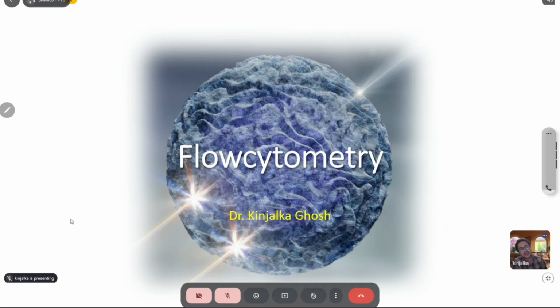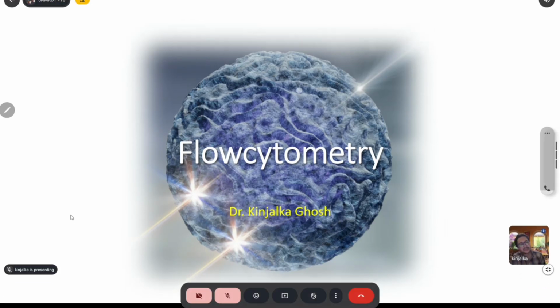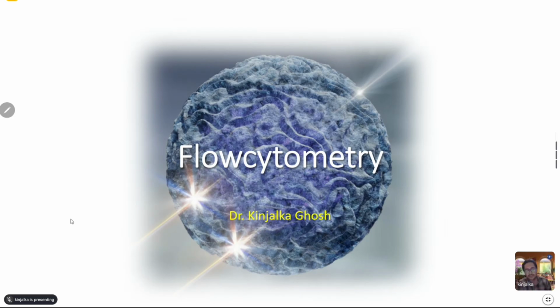Now, when we talk of flow cytometry in our hospital, even though it's not in biochemistry, it's there in Hematology. And they use it primarily for immunophenotyping different kinds of cells. The bone marrow is used sometimes to see what kind of clonal cells are there in that mix, right? So suppose it's a leukemia, and you want to know, is it a T cell leukemia or a B cell leukemia? Is it more of CD4, CD8 or other subsets? So the flow helps. Is it myeloma, right? So all those things, the flow gives a good diagnosis.